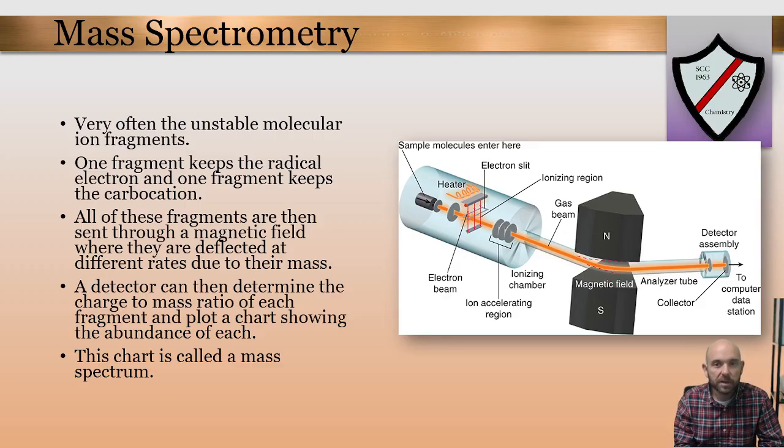And so then we can know that the biggest fragment there is the overall mass of our target molecule. And that's one piece of information that we can get from the mass spectrum: the mass of the molecular ion peak, which will be essentially the mass of the parent molecule. So we can put an unknown molecule in, and it should spit out on the other end its molecular ion peak, or the molecular mass of that molecule.